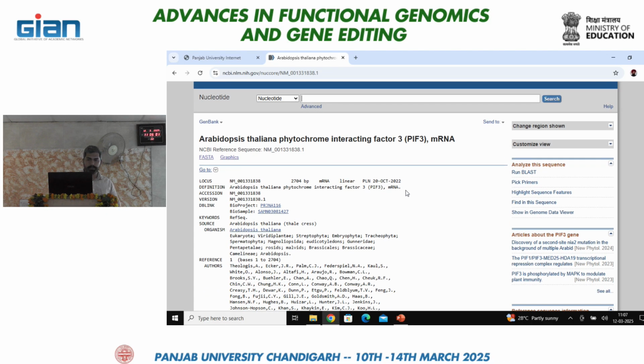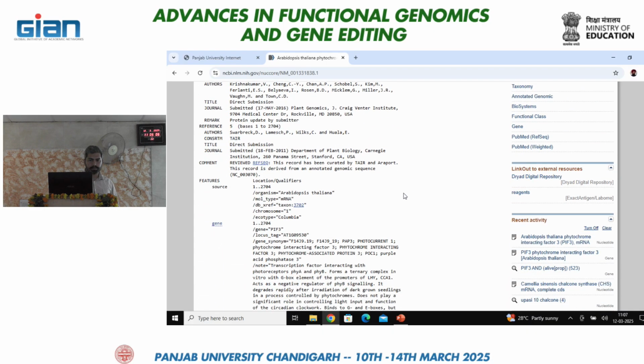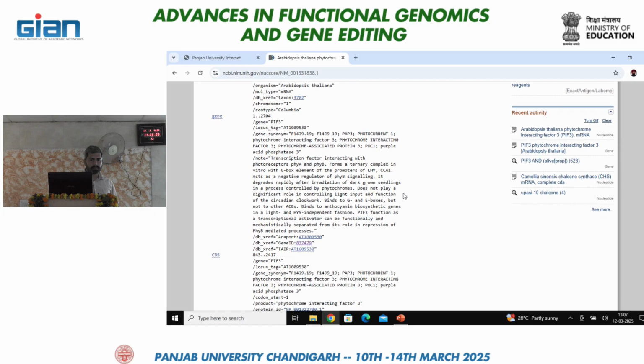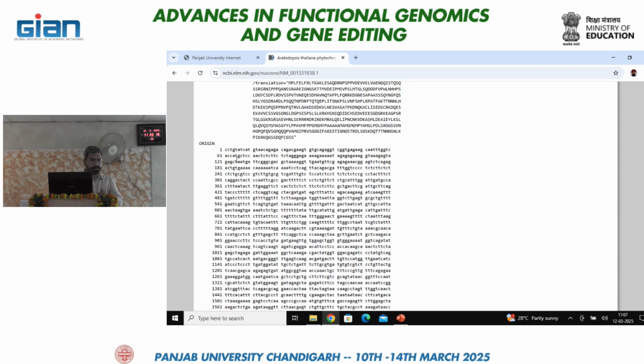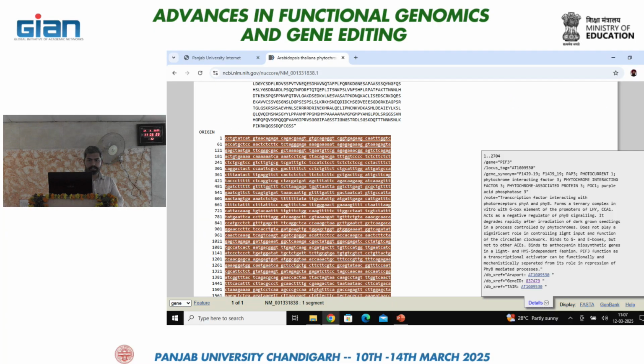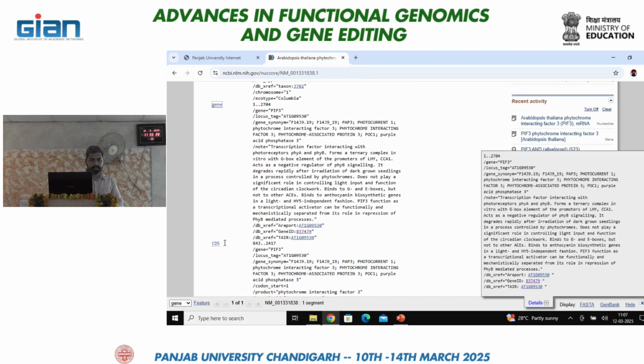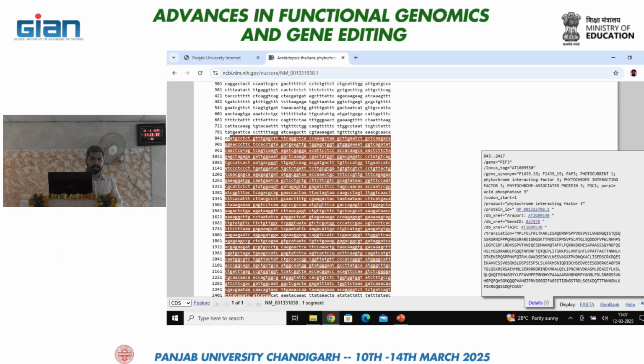From here you have to scroll down again, and then you can see gene written here and the CDS here, and this is the sequence of this gene, phytochrome interacting factor 3. If we click on the gene, it will highlight the whole sequence, but we want only the CDS, so we will click on the CDS, and as you can see, it will only highlight the coding sequence.